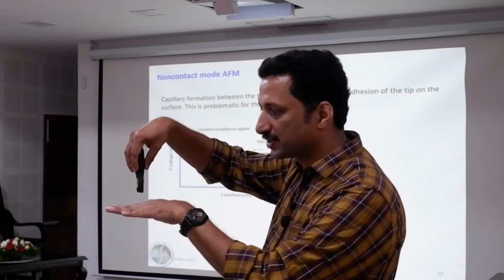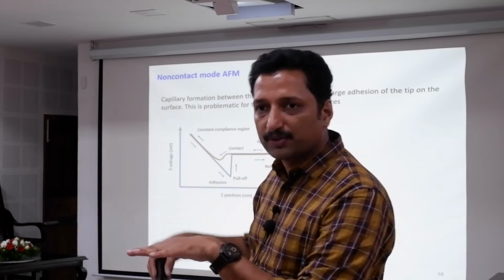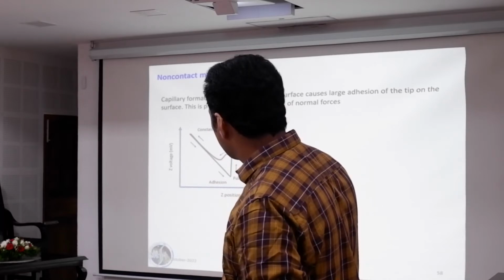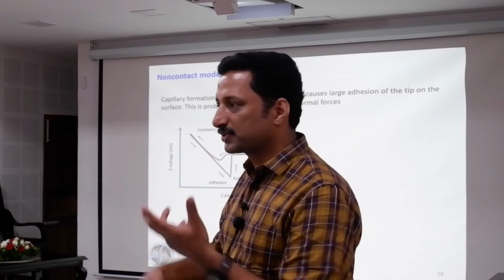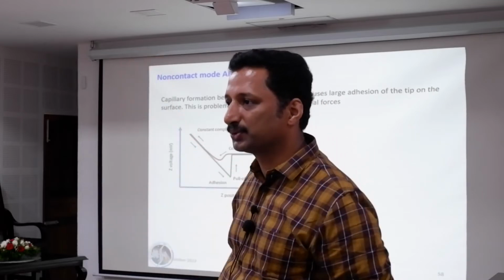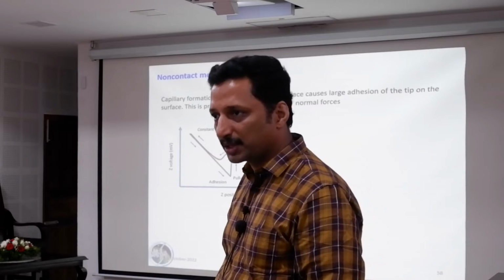Okay, you are in the attractive regime, but you are not touching it, you are a little far away from it. So for soft and biological samples, that is a good method. Here this is the problem. If it is contacting, if it is touching, especially biological molecules, there will be OH groups, so the tip also is hydrophilic, meaning they will attract each other, and you need to break that bond to get it out. So that's not good, contact mode is not good.